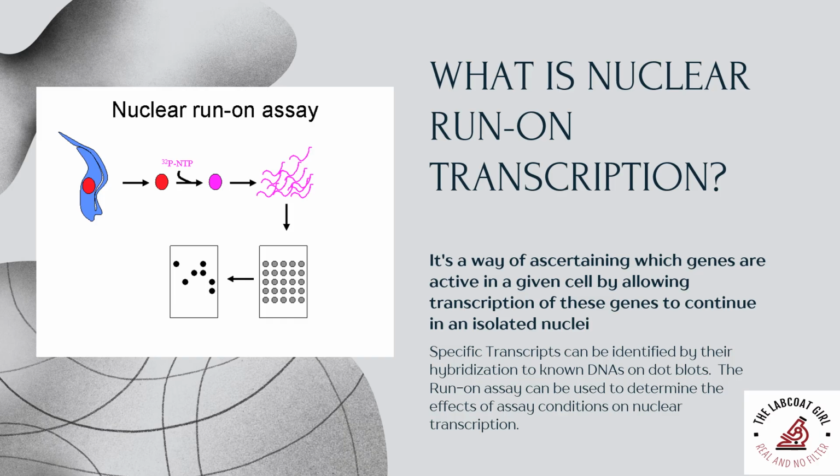You have one cell, in the cell you have one nuclei, and in that nuclei transcription has begun at that stage of some gene. I'm not naming the gene, just assume there's one gene whose transcription has already begun with the help of RNA polymerase, which means that there is some strand of mRNA which has formed. Now at that moment you have isolated the nuclei.